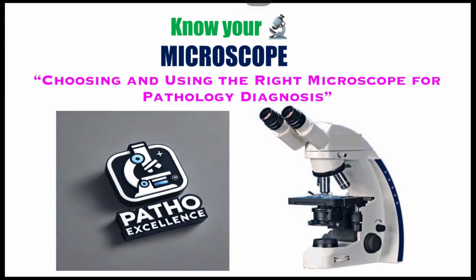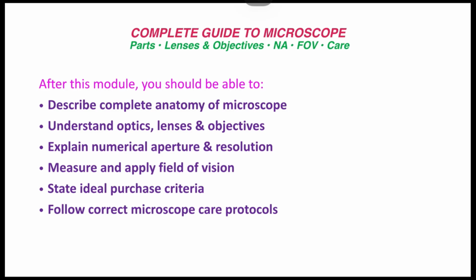And when you walk into a lab, you will see microscopes priced at either rupees 30,000, rupees 1 lakh or 5 lakhs, even more. And no one teaches you why. Is it just the brand name, or is it extra magnification? So, in this video, we are not just learning microscope parts, we are going to understand why some microscopes are expensive. What is the complete anatomy of a microscope?